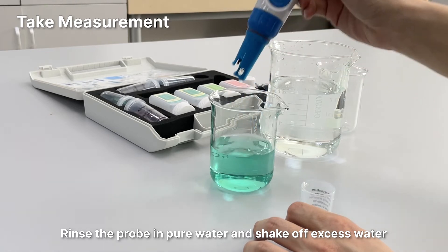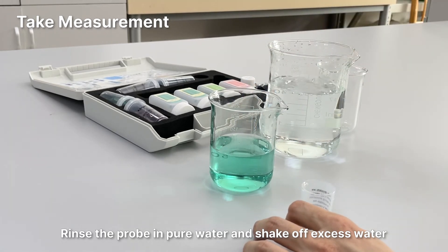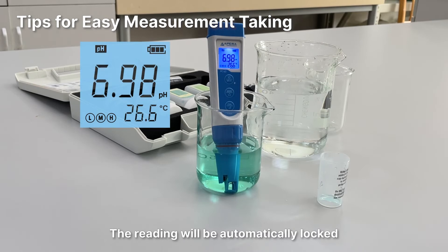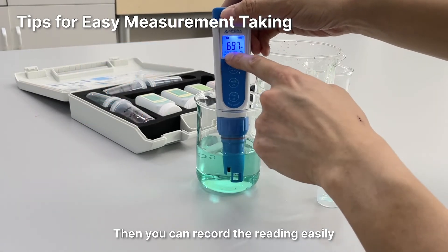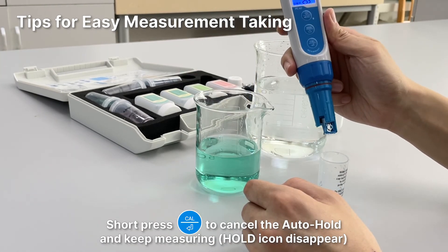Rinse the probe in pure water and shake off excess water. Tips for easy measurement taking: if you turn on the auto hold function, the reading will be automatically locked when it's stable for more than 10 seconds. Then you can record the reading easily. Short press Enter to cancel the auto hold and keep measuring.